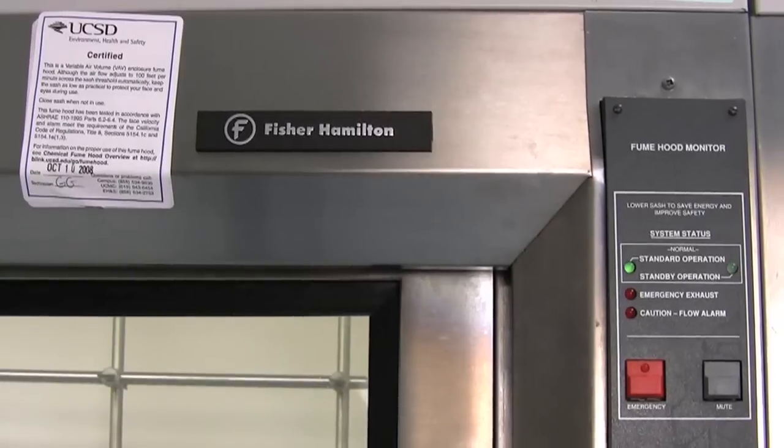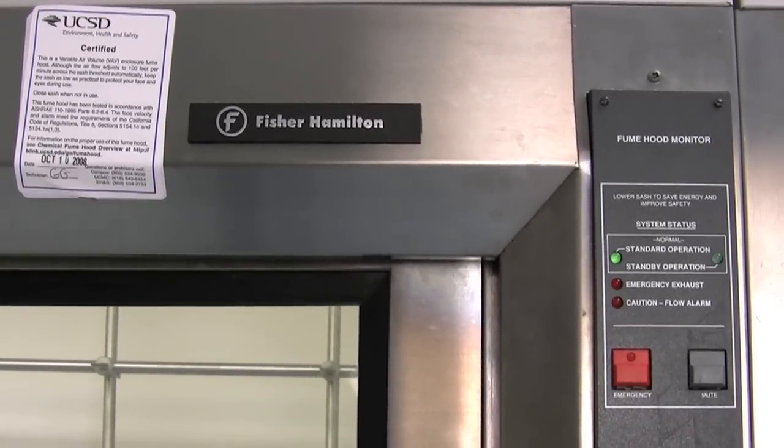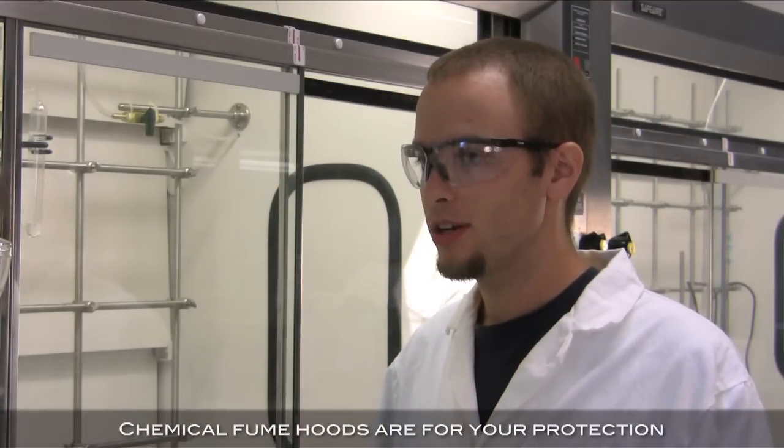I see your fume hood's working fine. Yeah, it was recently recertified and the light's green. And your Schlenk line is set up and clean. Do you know how to use it properly?